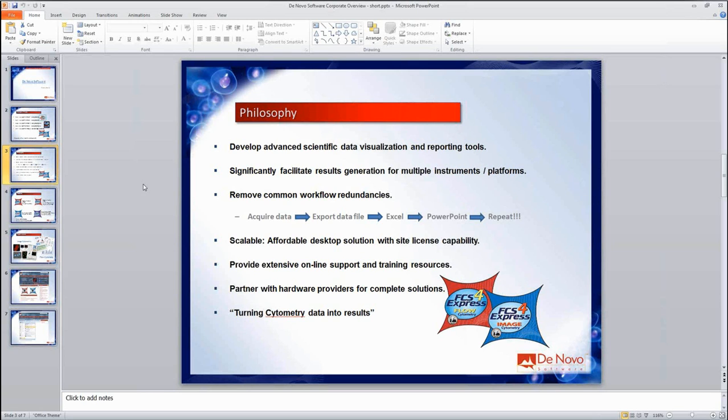That being said, we're compatible with any FCS files that come off of any machines, 2.0, 3.0. It doesn't matter how that scaling looks, whether it's on a 10-decade log or if it's 2.0 data that's on 1024 channels. We can certainly handle all of that.